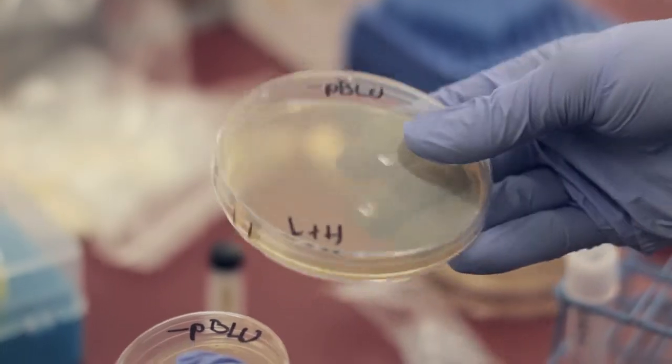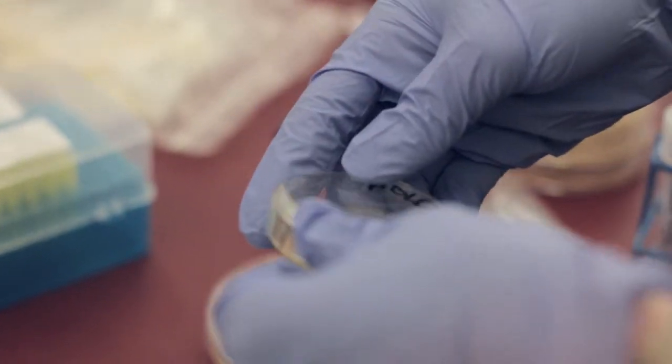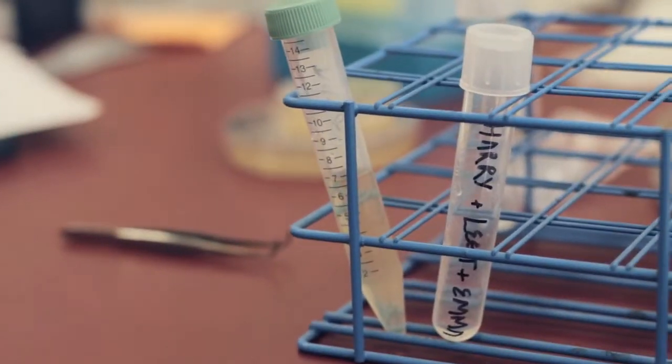We have E. coli cultures in here that have the plasmid in them. The goal of our project week is to basically understand plasmids and how they're incorporated and get a grasp on how they work.